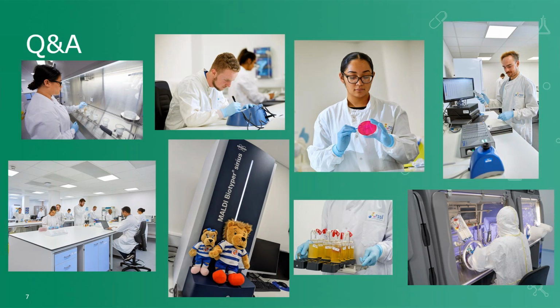But there's a lot of complexities around media fill design, and that's a topic that we haven't covered with this webinar series. I think that'd be something to consider. But yeah, media fill design is a whole issue.